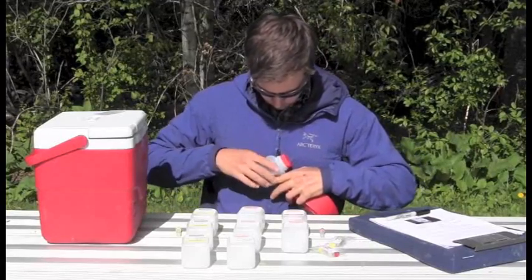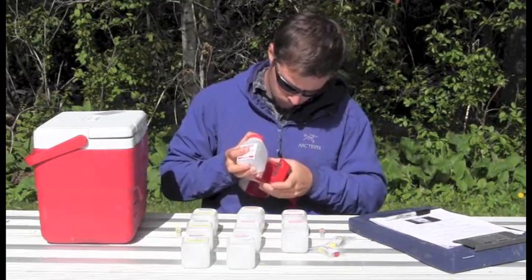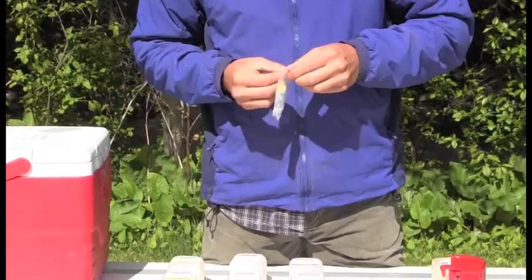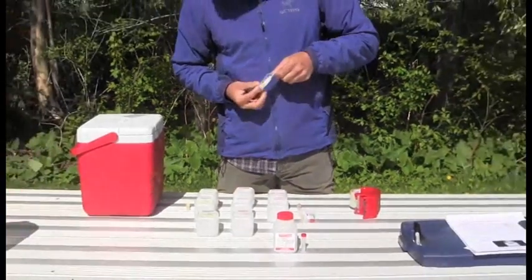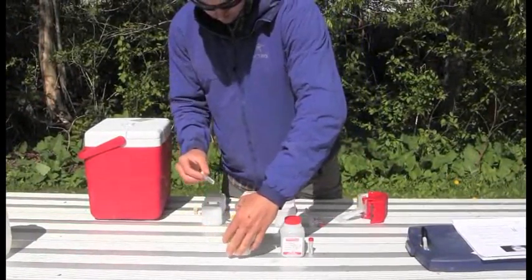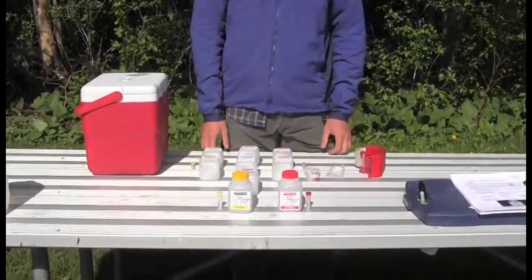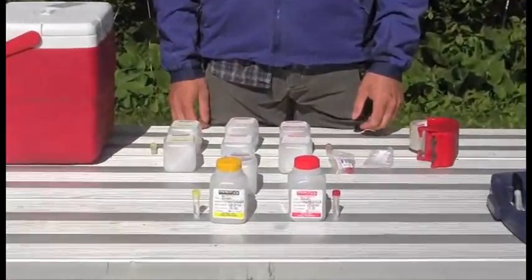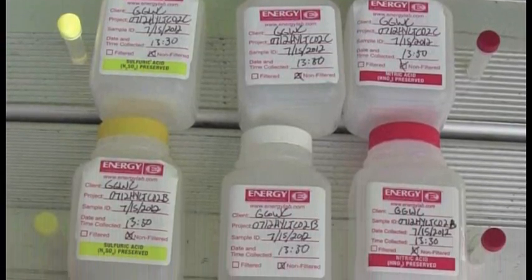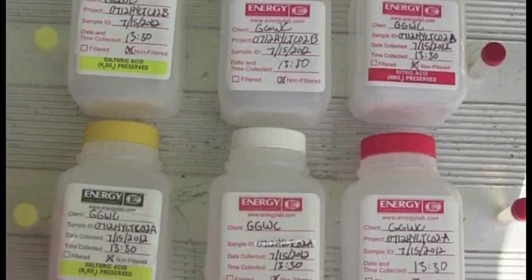Now that all of our bottles are labeled and taped, we want to make sure we have enough preservatives. In our field protocols, we see that we will need to preserve samples with sulfuric and nitric acid. Sulfuric acid comes with a yellow cap, and nitric comes in a vial with a red cap. We will match the cap of the preservative vial to the cap on the sample bottle, to ensure we have one acid vial for each bottle that needs to be preserved.